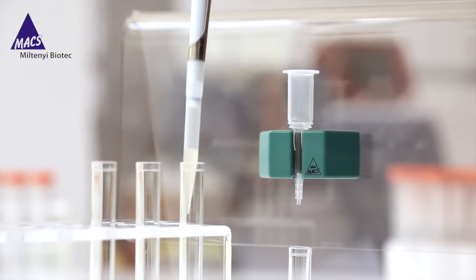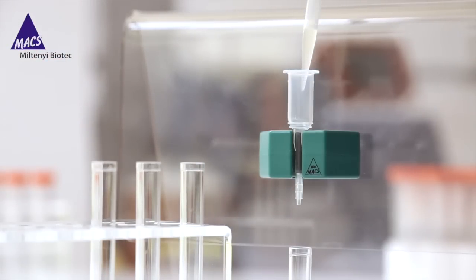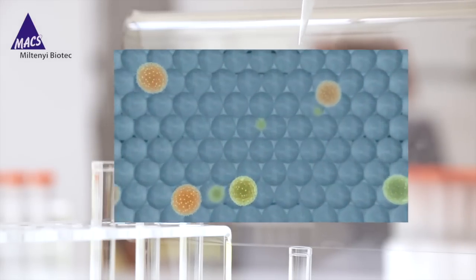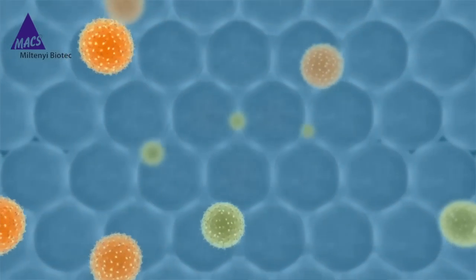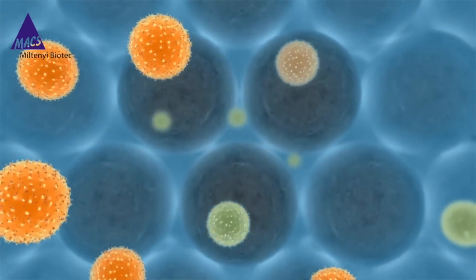Next, you apply the cell suspension to a Max Column, which is placed in the magnetic field of a Max Separator. The unlabeled cells smoothly pass through, whereas the magnetically labeled cells are retained in the column.